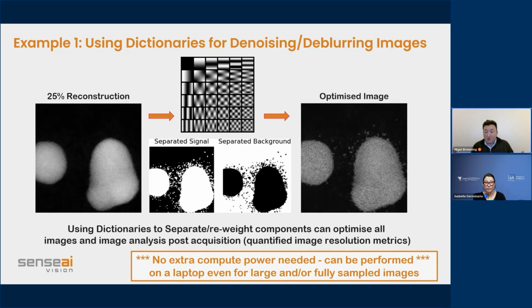They're giving us things that we don't really know the shape of a priori, and we can reconstruct it. And the reason we can reconstruct it is we're not changing the physics of the scattering process. That thing is a constant. And so anything that has these problems, in any image of any type, is going to benefit if you can use the Sensei approach to improve the signal to noise or in-paint the missing information.